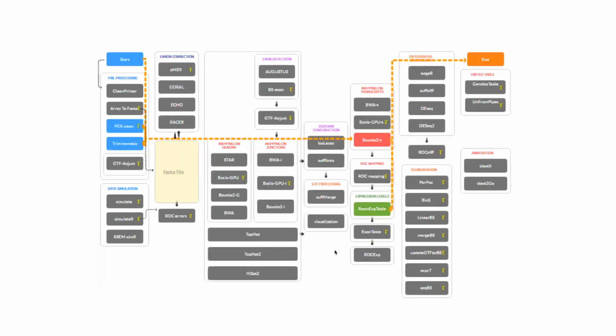So to explore how to do this, let us create two pipelines together. And I'll tell you a little bit about the data that we'll use to do this. The first pipeline is going to be very simple. We're going to do the pre-processing steps. Then we will do alignment or mapping on transcripts. So these are going to be known transcripts. And then we will use RSEM, or expectation maximization, a statistical technique to understand where those reads should be and how do we quantify them.